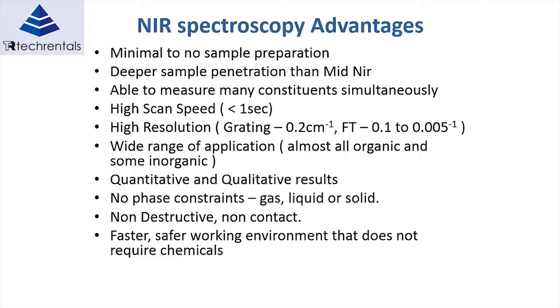It can work in 2 modes of operation. We can use quantitative analysis or qualitative results. The advantage of qualitative analysis is that it's a little less time consuming. There's no sample preparation to do. All we're doing is mapping the spectral signature into a different set of coordinates and measuring the variation that we're getting on that mapping.